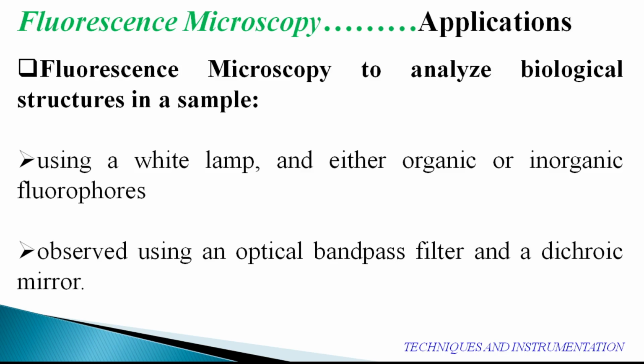So various biochemical industries rely on such type of fluorescent microscopy tool, and it is meant for the performance of molecular imaging to support different types of medical diagnosis, or sometimes in research also. So to carry out research into cellular structures, especially at the nanomolecular activity level, meaning internal metabolic pathways, they can be studied by means of such type of fluorescence microscopy.